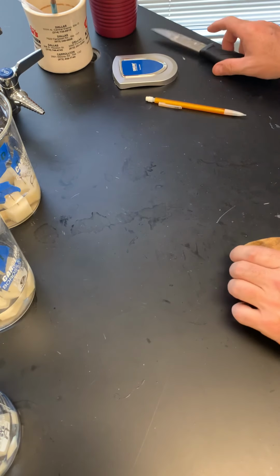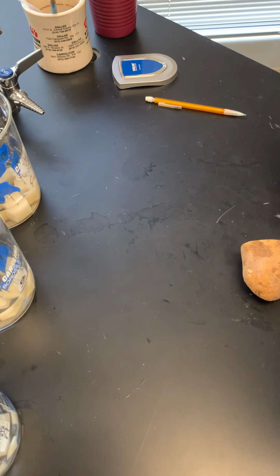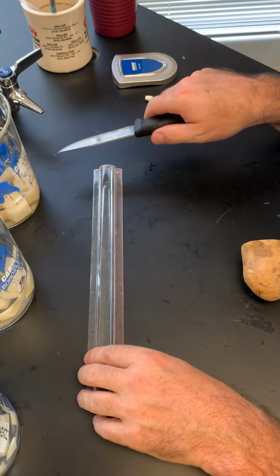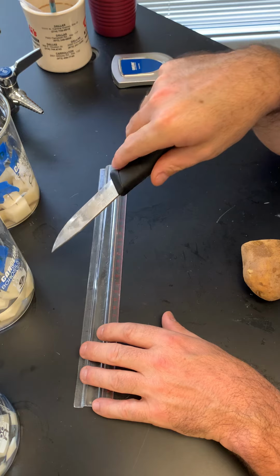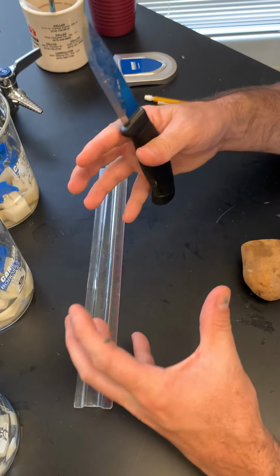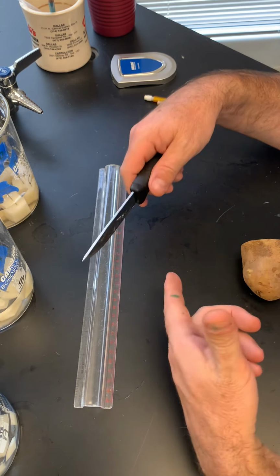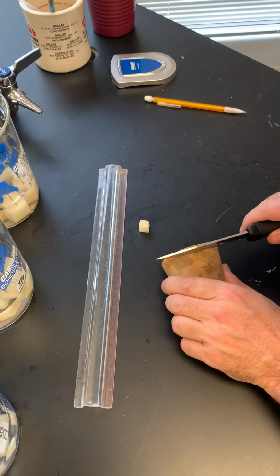So what do I do? I don't have a scale, Mr. Pope. What am I going to do? Well, use your old noggin. Not only are they going to increase in mass, but they're going to increase in size. Their volume and surface area themselves are going to expand. If they take in water, they're going to have to get bigger. So you could cut these and then measure them. I already cut these. They're pretty small, but I'll show you how I did it.